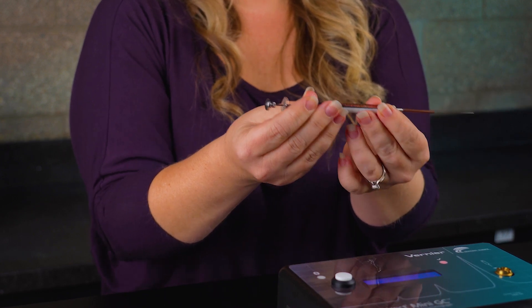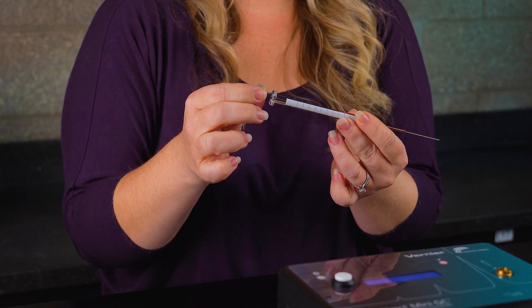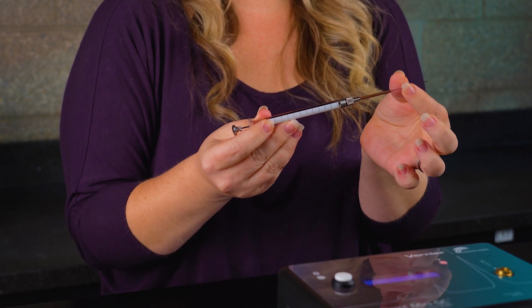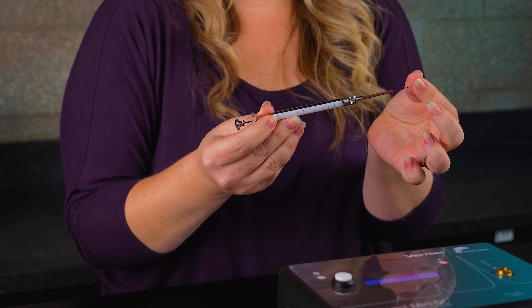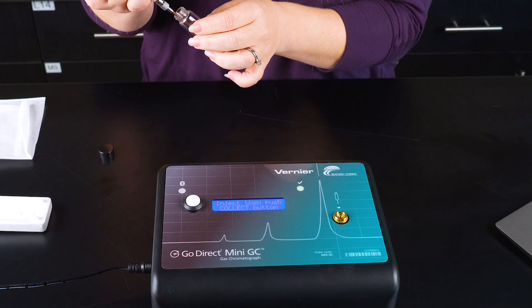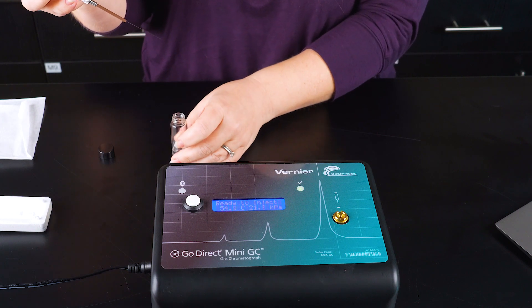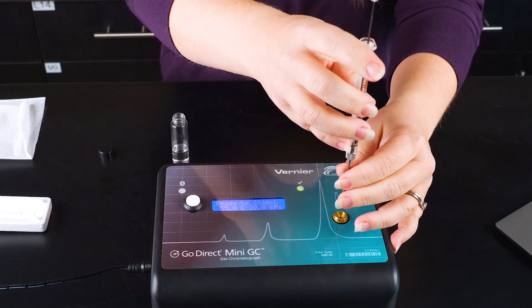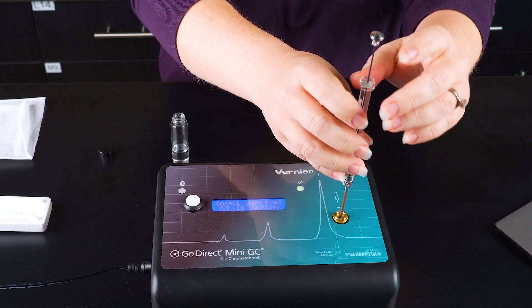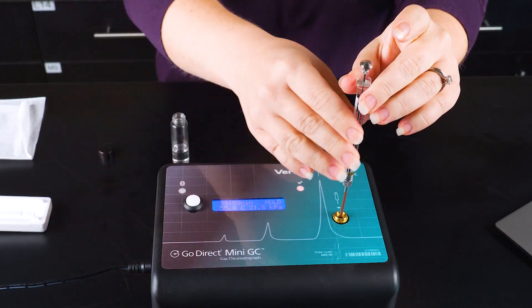If they ever pull out the plunger, it will not come back in, and the needle should definitely be treated with care because if it becomes bent, it will be near impossible to salvage. So now that the Mini-GC is warmed up, we want to collect about 0.4 microliters of sample and put the syringe into the injection port. And when I press down on the plunger, I press the white button at the exact same time. So now we just wait for our four compounds to elute.